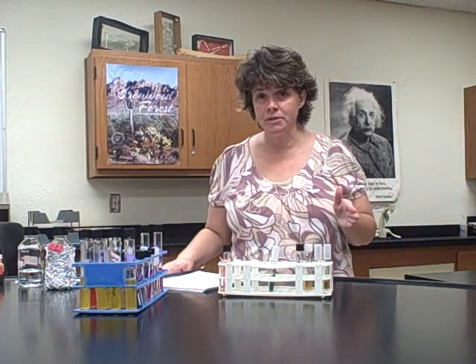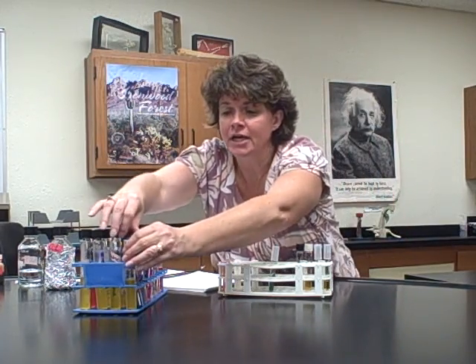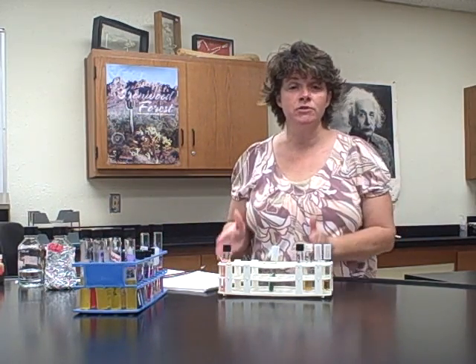What I want to make sure that you do is not only look at the results of your bacteria, but also look at the results of the other group that had the same bacteria and make sure they match. Because somebody may have made a mistake, I won't name anybody, no, just kidding. It's possible that somebody could have not inoculated it properly and you're going to get different results. The other thing is if you tightened your tubes on too much, you're not going to get a result, okay? So make sure that you match with the other one, or sometimes you don't get enough inoculum in, enough bacteria, but maybe the other group did.